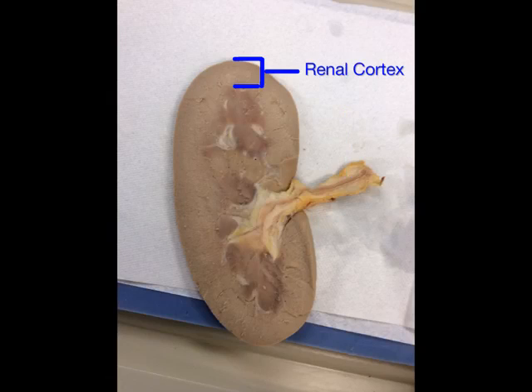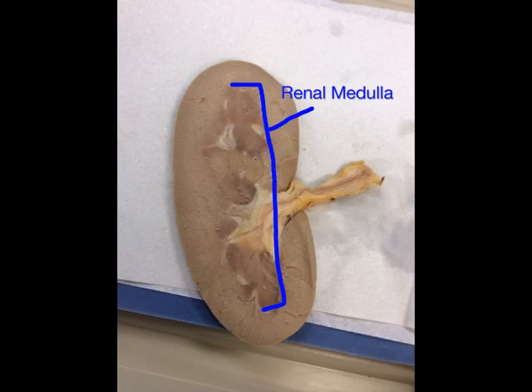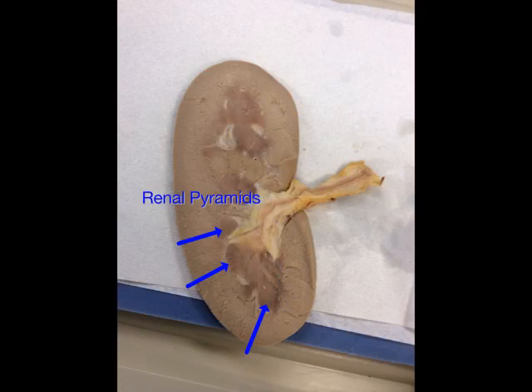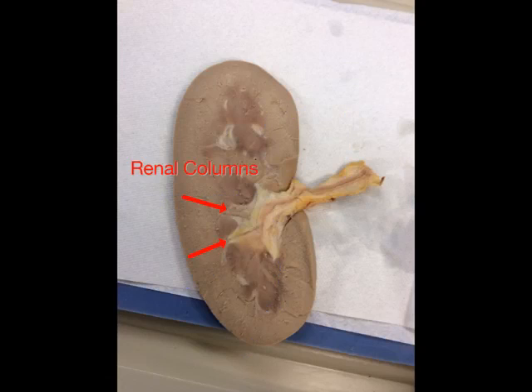The outer layer of the kidney is called the renal cortex. The inner layer of the kidney is called the renal medulla. The dark structures within the renal medulla are called renal pyramids, and in between renal pyramids are renal columns.